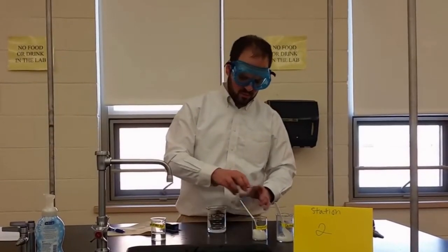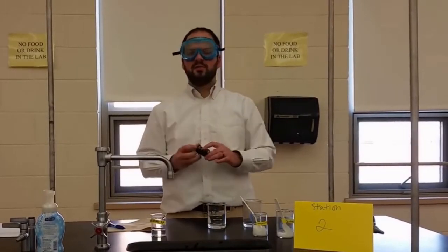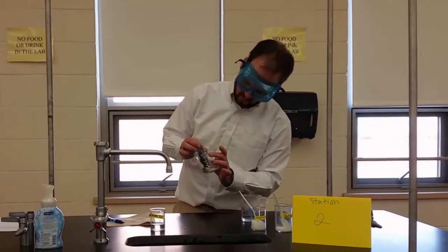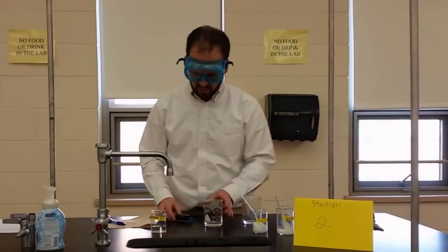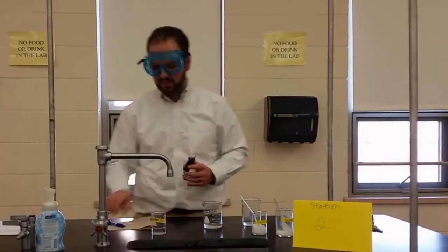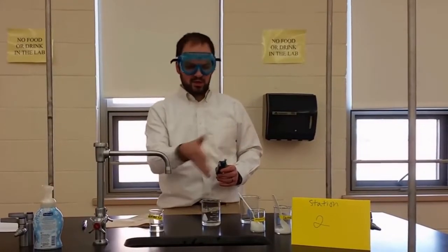So swirl and swirl. Then you're going to take your conductivity meter and lower it into there, again, making sure not to get the circuit board wet. So you're going to interpret the lights to see how well the lights light up and use the guide on the back.